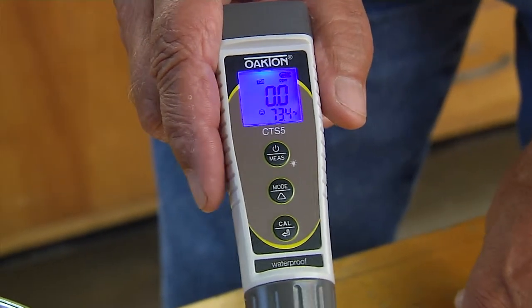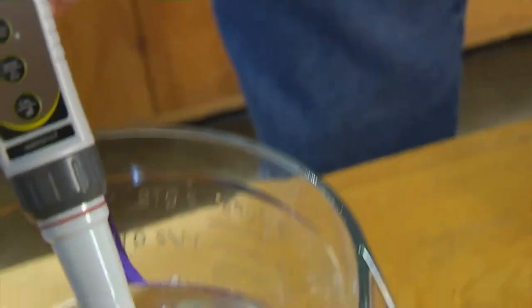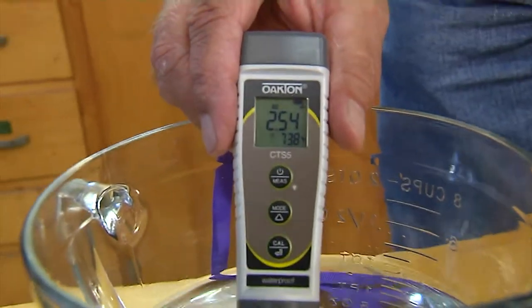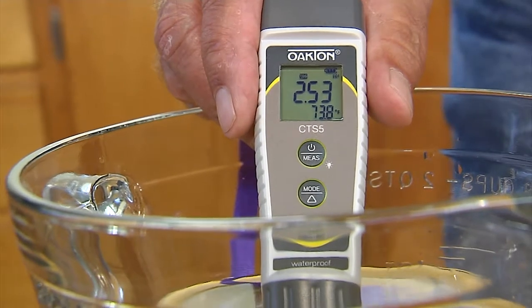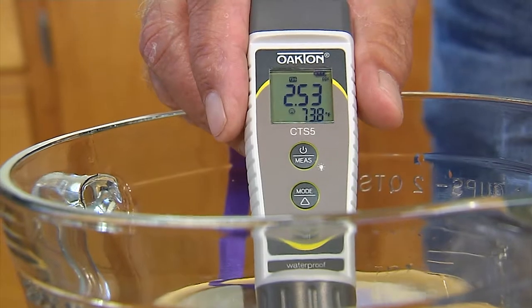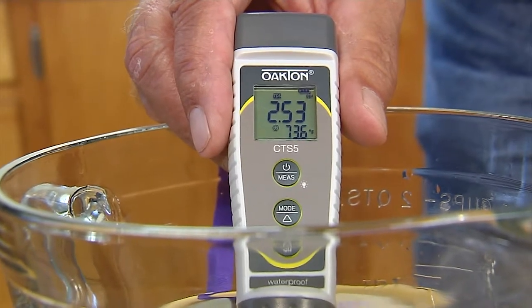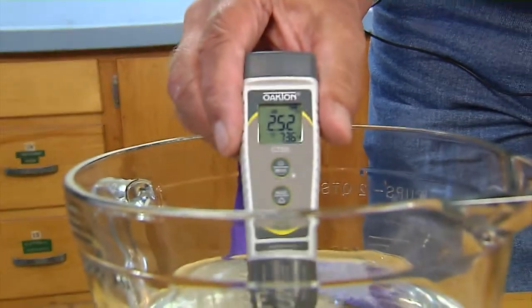Now we'll go into reading mode, and right up here it says TDS. If I just stick it into the water and swirl it around, you can see it's reading about 2.54 parts per thousand. If your meter was set to read in parts per million, it would be 2,530. And that's about right — that reading could vary anywhere from 2.4 up to 2.6, and that would be a good reading.